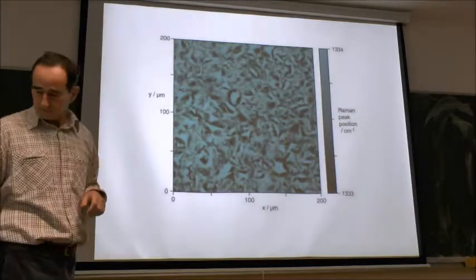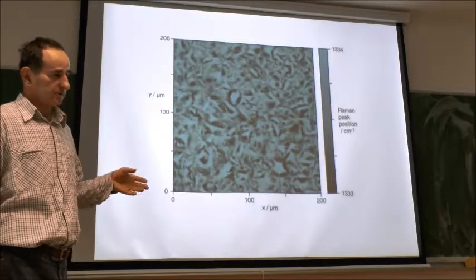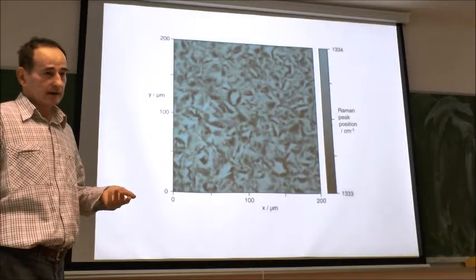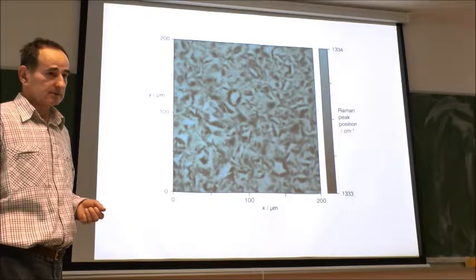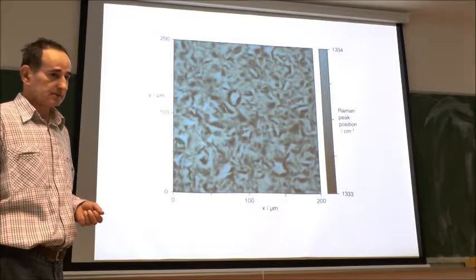There is a connection which would reflect laser light to the horizontal position. But of course, you cannot scan on the notebook. It's just a bulk measurement.